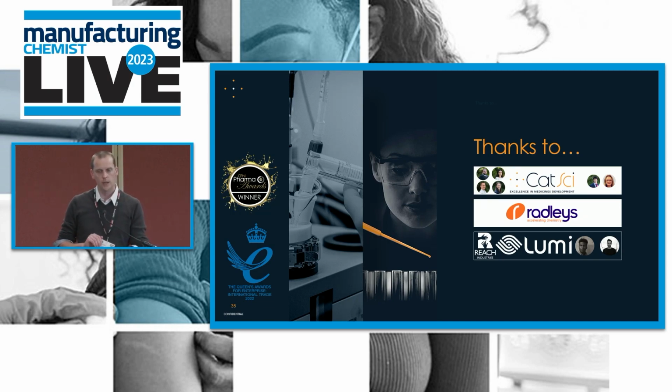With turbidity, what it's doing is looking for something behind the image, behind the process vessel, and it's looking at fuzziness, essentially. So it's not a turbidity measurement as we would have in a process. It's a proxy for that. But the machine learning game is to take that data and compare it with true turbidity data to come to some sort of alignment.